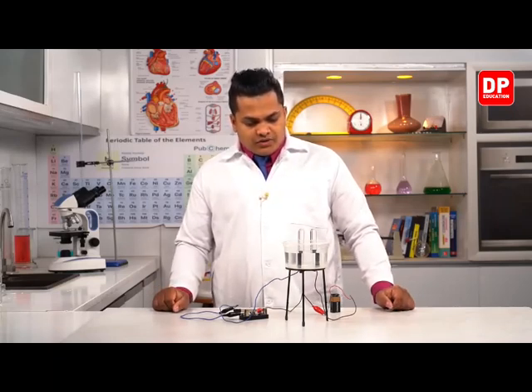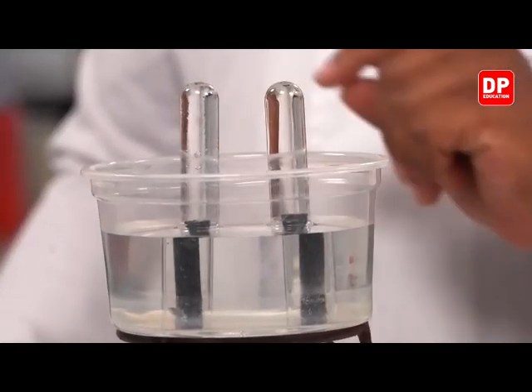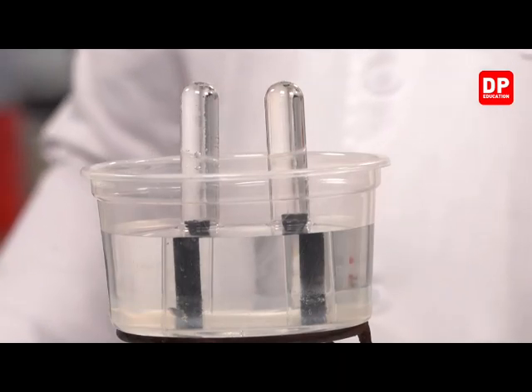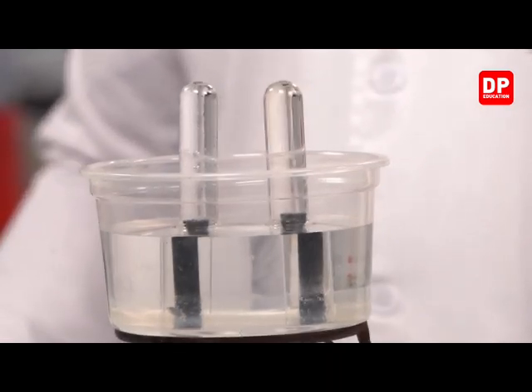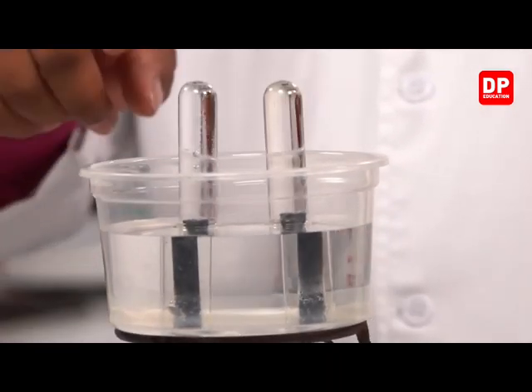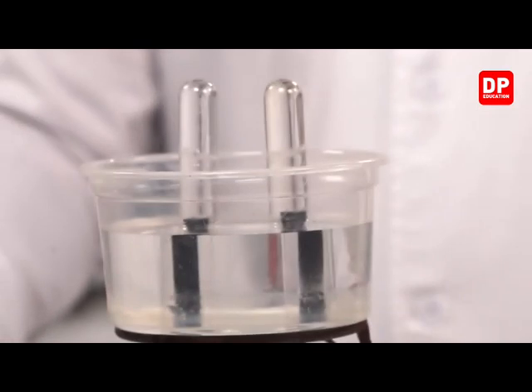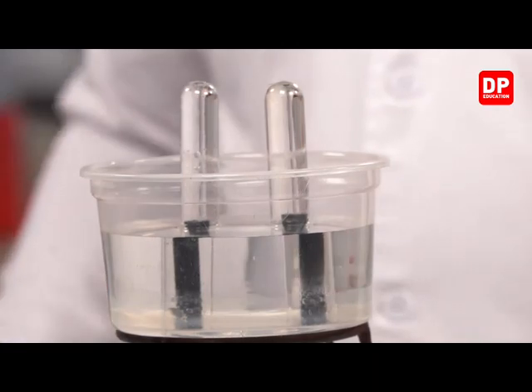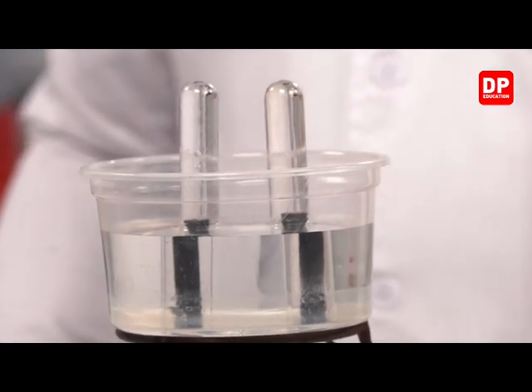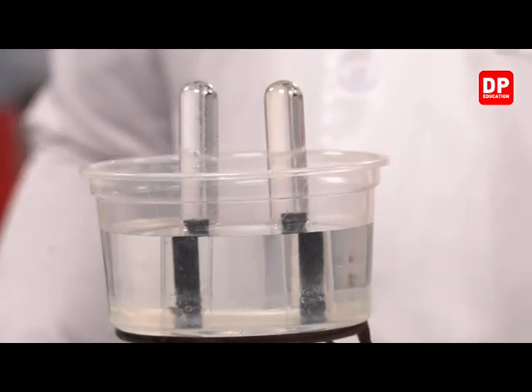As soon as I turn on the switch, here you can clearly observe gas bubbles coming from both the test tubes. However, we can observe a large amount of gas bubbles coming from the negative terminal. See, from the blue color negative terminal, a large amount of gas bubbles are coming out. From the positive terminal, once again gas bubbles are coming, but not as much as the other terminal.